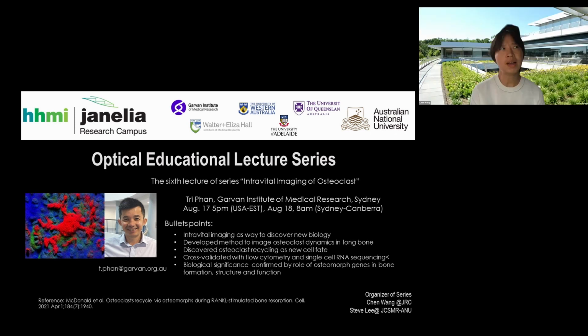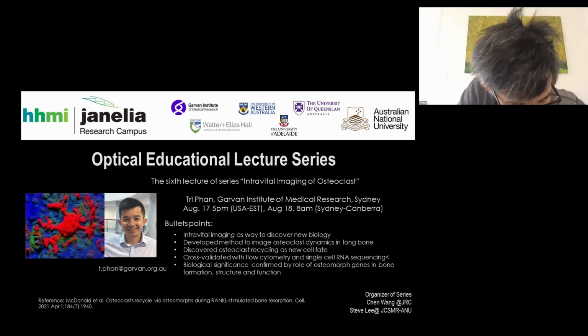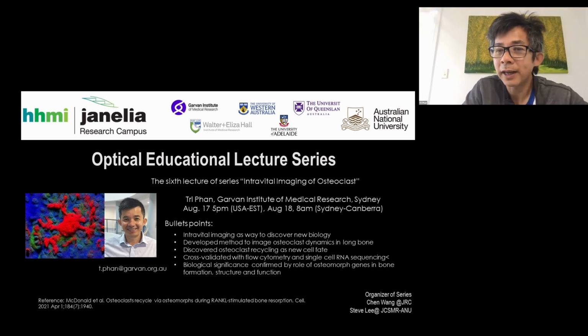Cool. So you talk about label-free. Would you consider other modalities for imaging, or even consider spectrum? Oh, absolutely. We've mostly used optical imaging, particularly two-photon. About 10 years ago now, we developed a microendoscope that goes on to the end of a colonoscope for imaging in patients with inflammatory bowel disease.